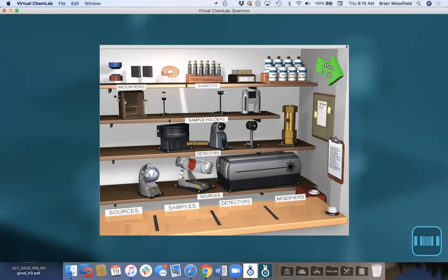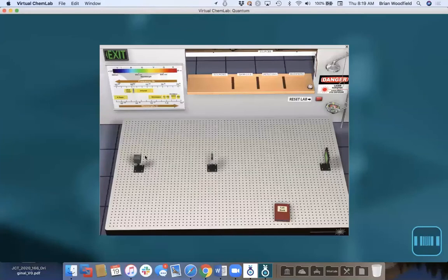You can mix and match, and you have these modifiers. I'll show you kind of how they work. But you can mix and match and build it on this table and do experiments. We have all the different permutations and all the different outcomes, and we encourage them to explore. It's really cool for them to find things that don't work, that blow things up or burn or catch on fire. And we have that.